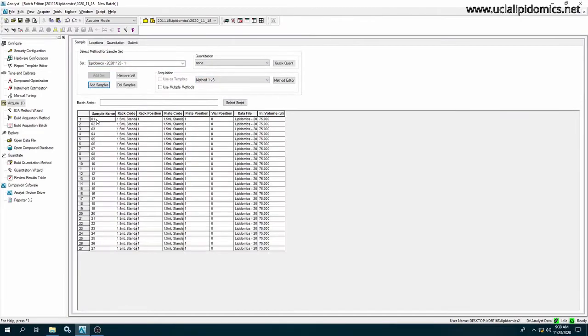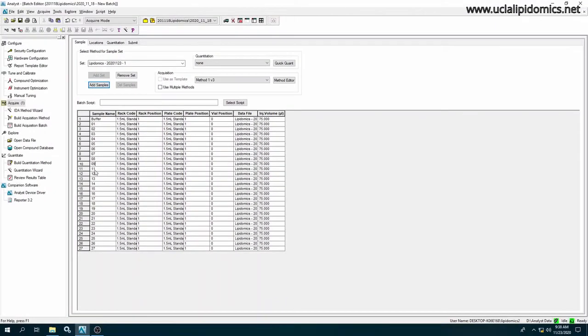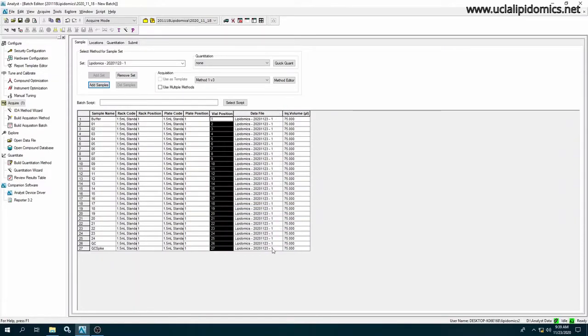For the Assistant workflow, it is important that all samples for analysis be assigned a number without letters or symbols. Letters or symbols denote controls like blanks and QC samples, which users don't wish to include in certain analysis steps. Once the sample IDs and vial positions have been assigned, we can submit and run the batch. The process is then repeated for method 2, with the same IDs being assigned to each sample in the second batch.